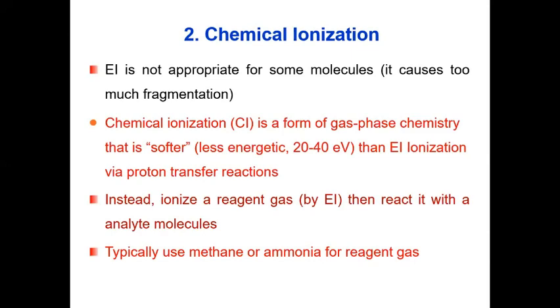So in chemical ionization, we will not directly hit the molecule with the electron beam. First we will ionize a chemical, some reagent gas like methane or ammonia.